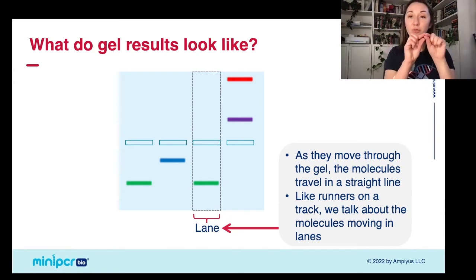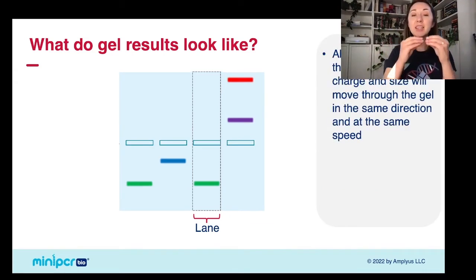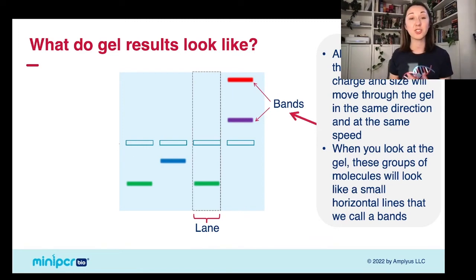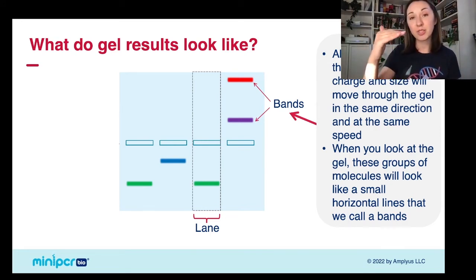And each of those sort of horizontal stripes is a group of molecules that are all of the same size that moved through the gel together. And we're going to call each one of those stripes a band. So this is some of the vocabulary that your students are going to be working with in this Rainbow Lab, but is the same vocabulary that they would be working with in a DNA gel electrophoresis lab. You have lanes and you have bands. So when you look at those bands, again, that means that all of the molecules in that area are about the same size because they moved the same amount through the gel.